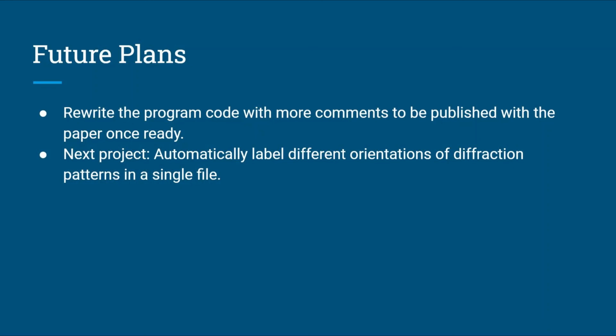Future plans. We plan to rewrite the code to be more readable and add more comments so we can publish the code with the paper when it's ready. Our next project is to write a program to automatically label different orientations of diffraction patterns in a single file.